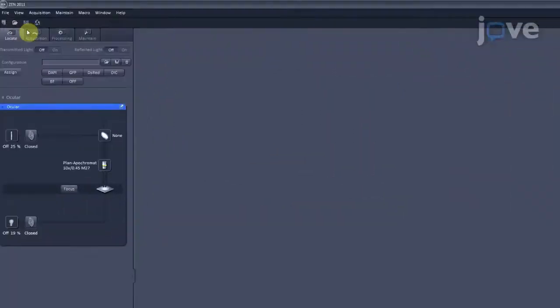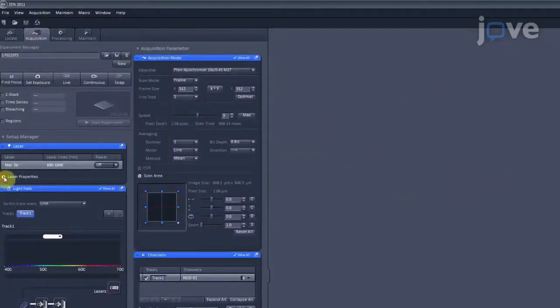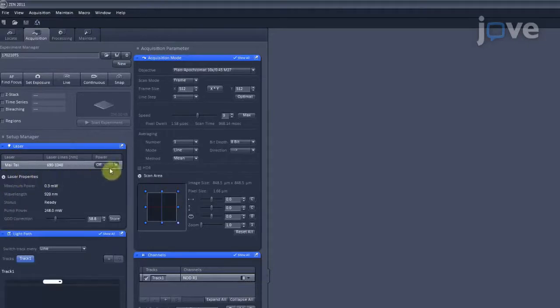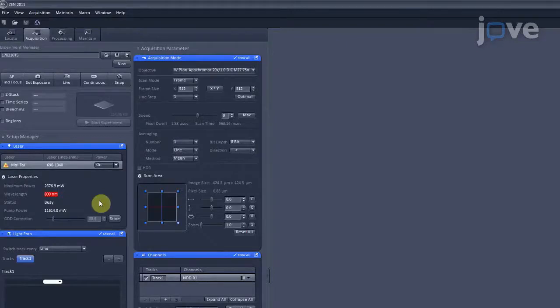Open the image acquisition software and under the Laser tab, click the On button to turn on the laser. Wait for the status of the laser to change from Busy to Mode Locked.